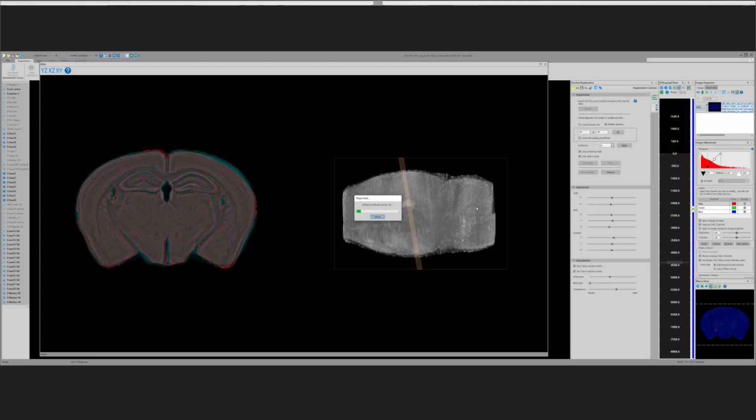And again, this takes about an hour and a half or so to run. Once you set it up, you can go leave and do other things. So it's just computing time. You don't actually have to do anything. It's doing it automatically.